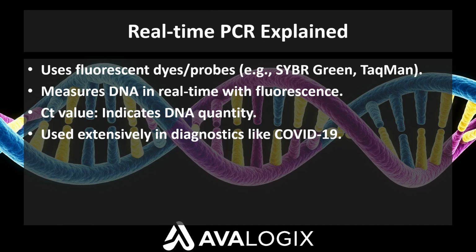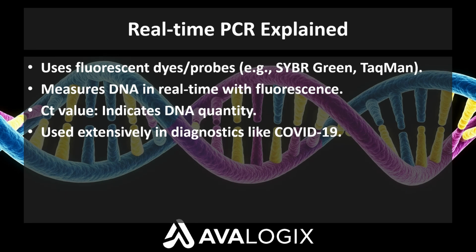A key metric used in qPCR is the CT value, cycle threshold, which indicates the cycle at which fluorescence surpasses background levels. A lower CT suggests a higher amount of starting material, important in interpreting disease severity or infection levels, e.g., SARS-CoV-2 viral loads. For NEET, remember, qPCR provides quantitative results. Fluorescent detection is central to real-time monitoring. Taq polymerase and probes are key players.